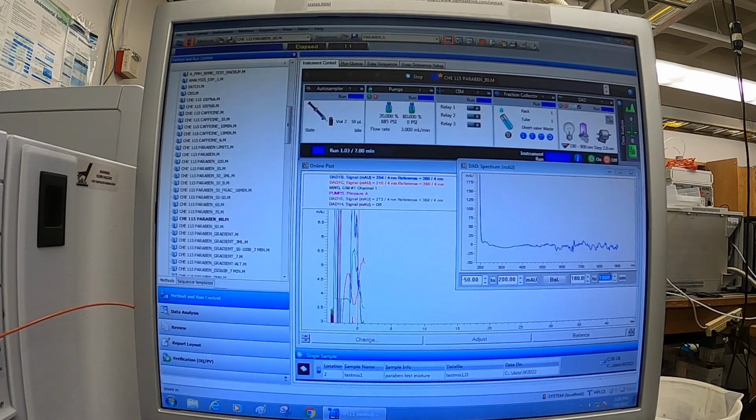And it looks like we're going out to 1,000 here, so that means the tungsten lamp is on. And so what, about 920 maybe? I guess we could go a little bit higher. Let's try 250. 300. But this is never going to change because methanol's in here, right? And so methanol really absorbs down here, and so notice how we have a little peak down here at 210.